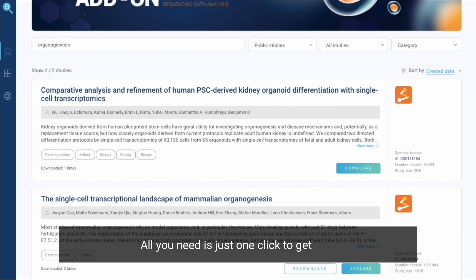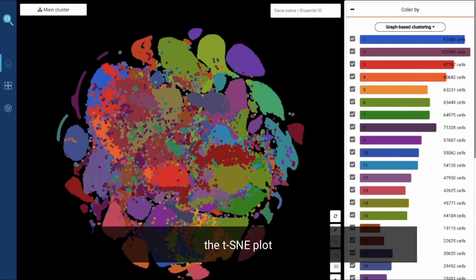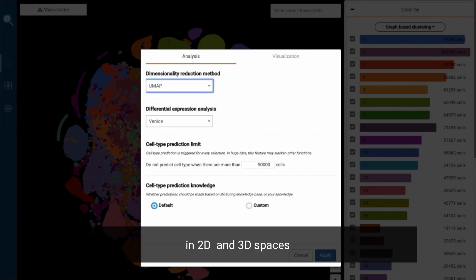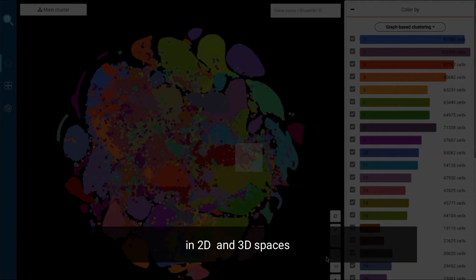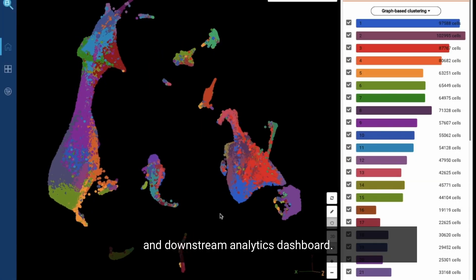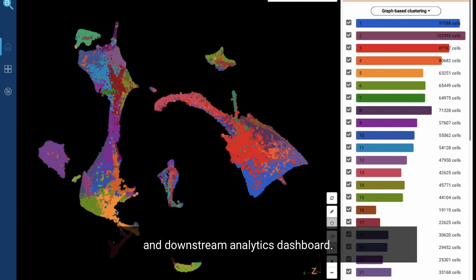All you need is just one click to get the t-SNE plot and the UMAP in 2D and 3D spaces, and a downstream analytics dashboard.